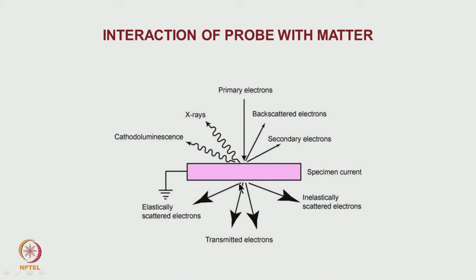Okay. In addition to this, the electrons could be elastically scattered. This elastically scattered electron could be scattered normally, as we have discussed earlier. Conventional diffraction is a process of elastic scattering of a coherent beam. But in that case, the Bragg angle is less than 1 degree. Here, when the angle of scattering becomes more than 3 degrees, or 5 to 9 degrees, in those regions it is essentially an incoherent beam. Okay, but it's elastically scattered. This also gives rise to some information.